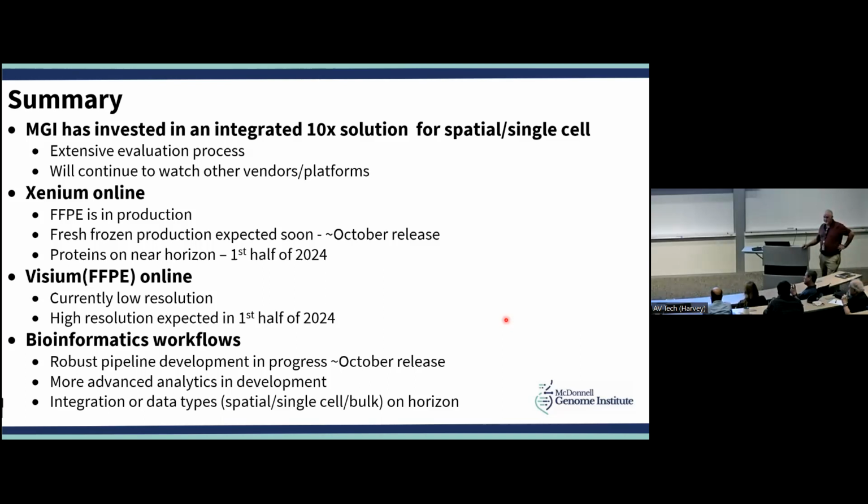The 10x component, I think, would be roughly the same. And then the sequencing, depending on how deep or shallow you might want to sequence, that'll vary. But yeah, I think the thickness is the same, 5 to 10 microns.